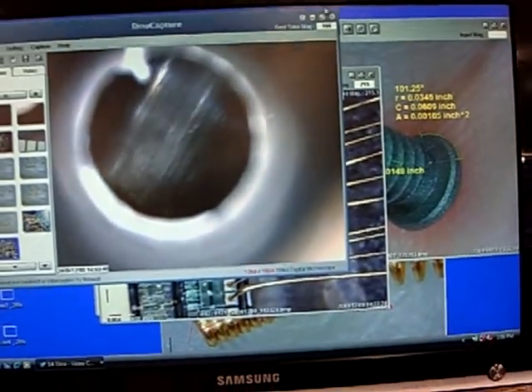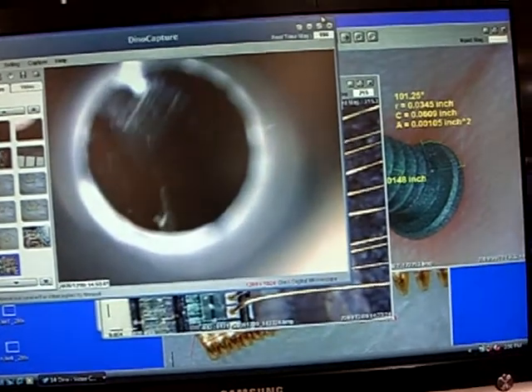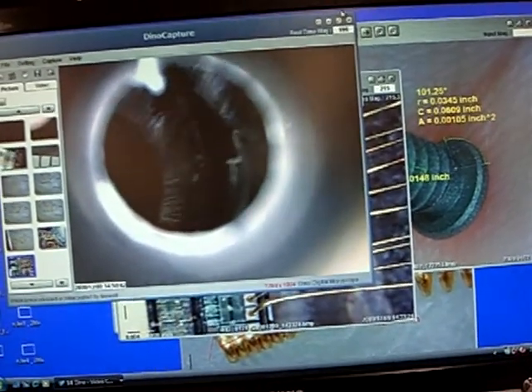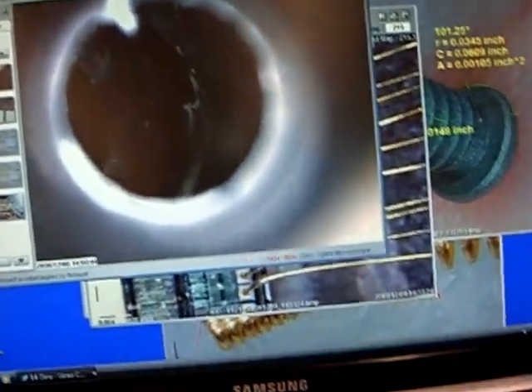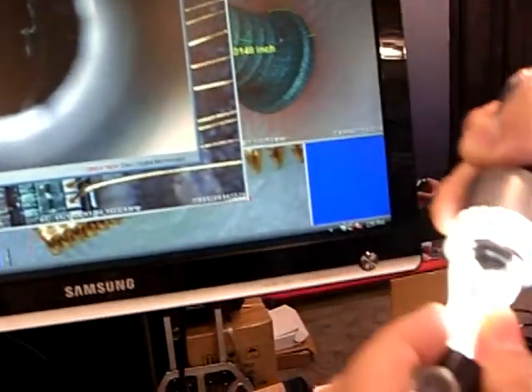Okay, you can see right now I'm moving it. I can see the full screen.